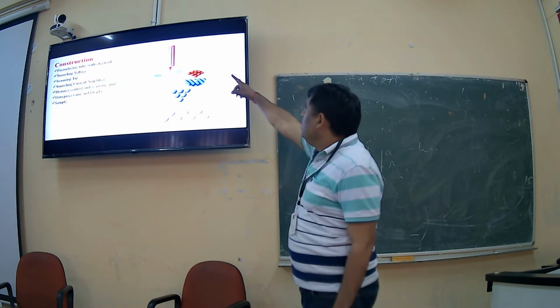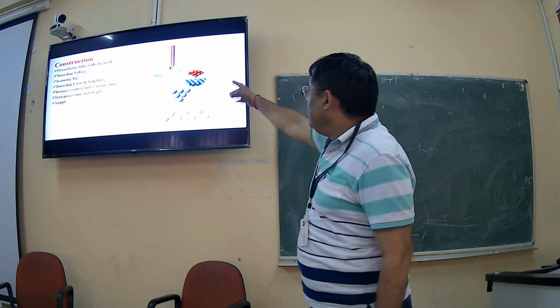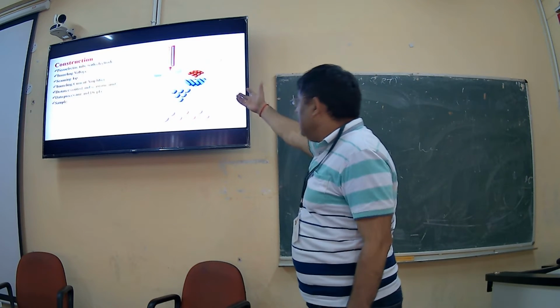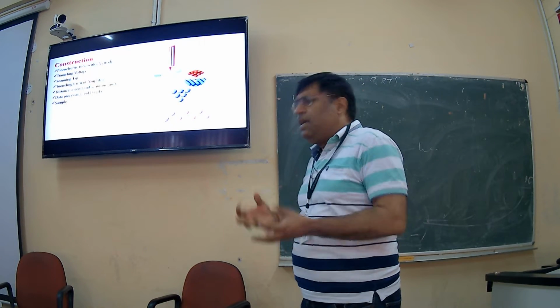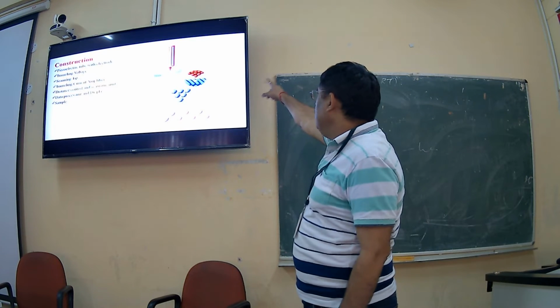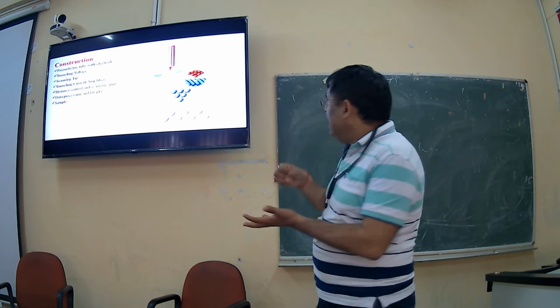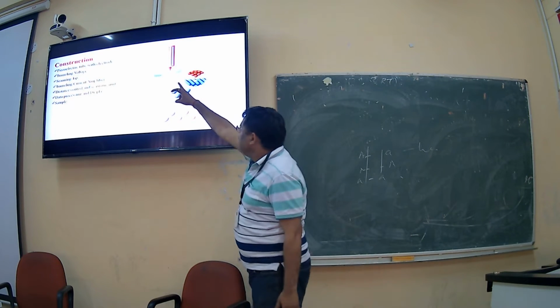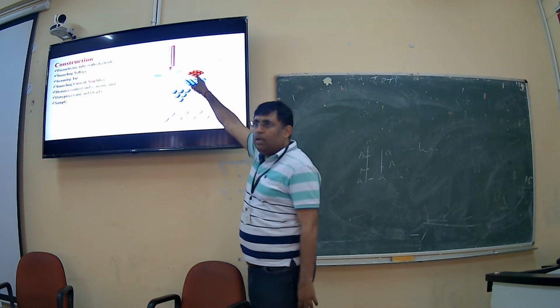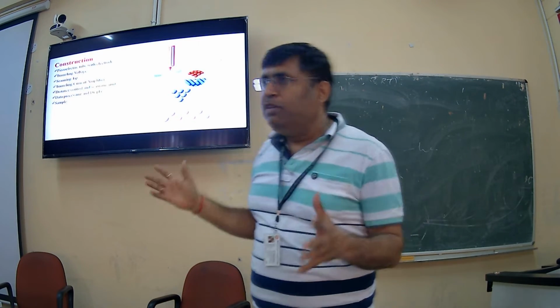Okay, so same, you can see there is a piezoelectric tube with electrode, and there is a tip, and there is a sample, and then there is a tunneling current amplifier. So what it does, it just amplifies the current. It's nothing. So everything is almost same, and then you will get the data processing. But here the importance is that it's too close. See, the tip and sample is too close. So your current can tunnel. Current can go there. Okay? So the circuit will be complete and you will get the image.